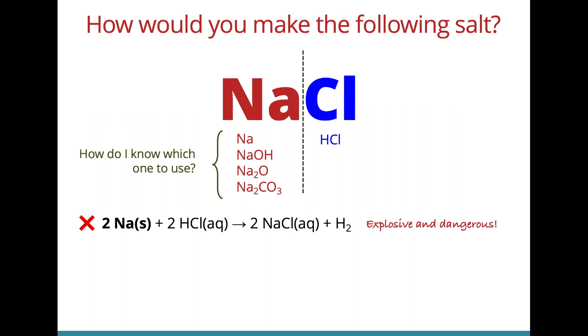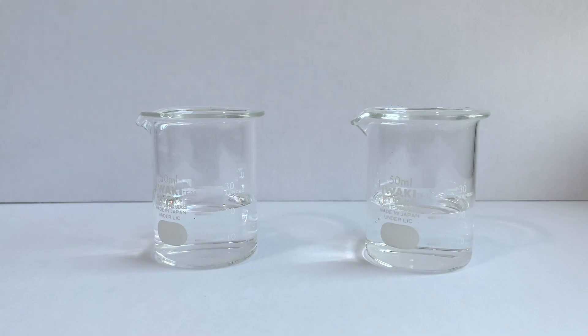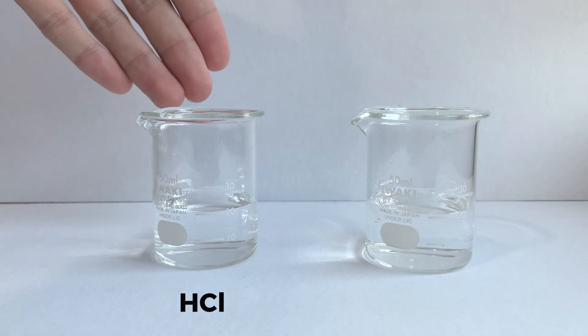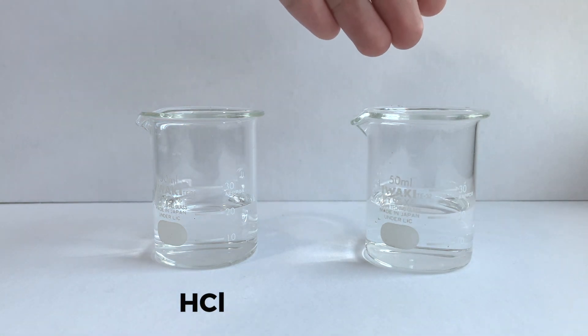Instead, a safer method would be to use the reaction between an alkali and acid, for example sodium hydroxide and hydrochloric acid to form sodium chloride and water. Now let's head over to the lab and I'll show you what I mean when we say we are reacting an alkali with an acid. On the left hand side I have hydrochloric acid and on the right hand side I have sodium hydroxide.